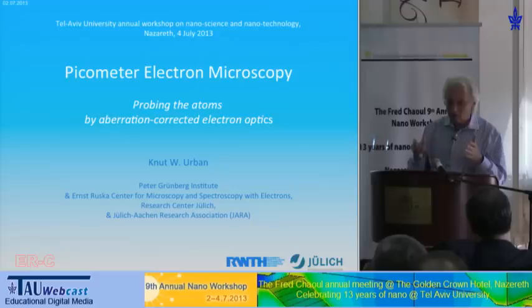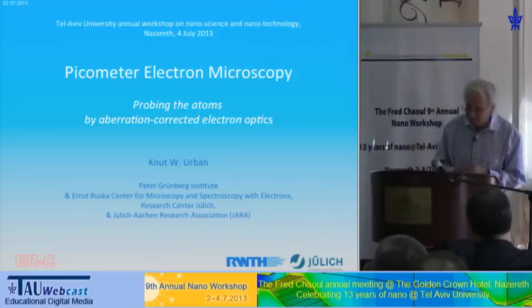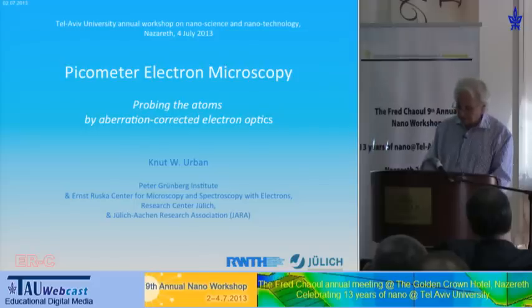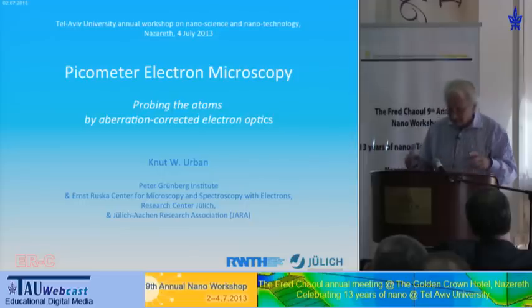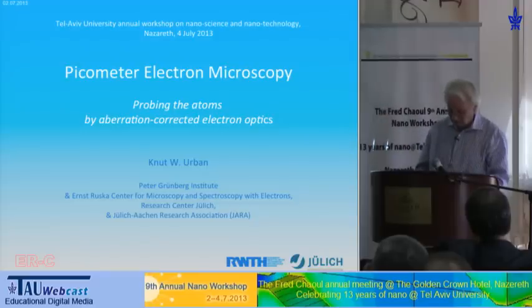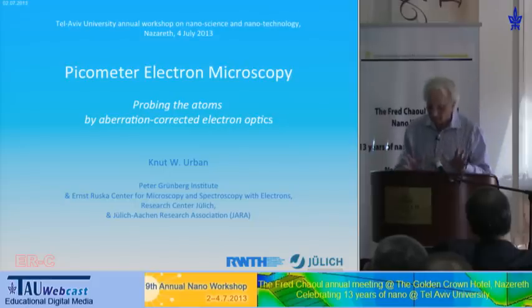And this, if you allow me the word, simple-minded view is forming the background for the general ad hoc assumption that electron microscopy in atomic dimensions, just by pressing a button, so to speak, is able to obtain something like a projection of the atomic structure, of the atomic arrangement inside the highly magnified sample. And this view is, of course, inadequate. It's, in some cases, entirely wrong.